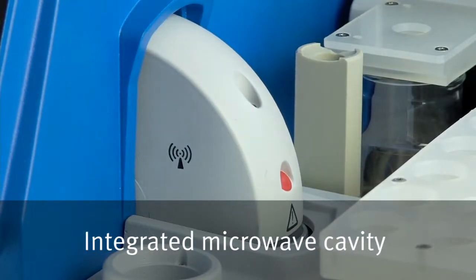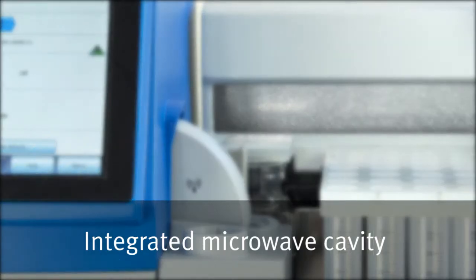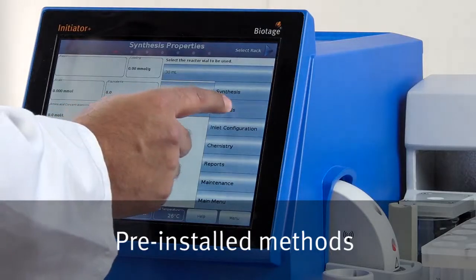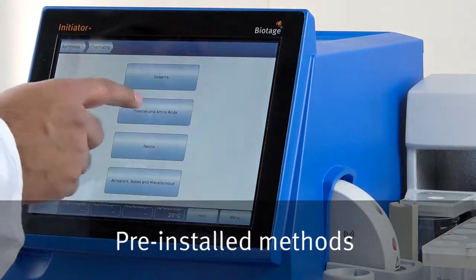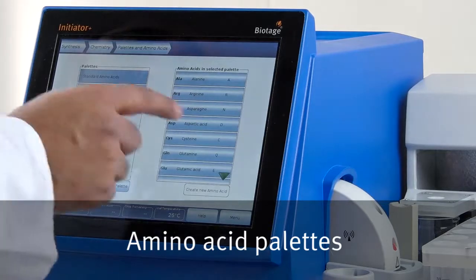The microwave unit is based on our best-selling Initiator Microwave platform. The system comes with a number of pre-installed methods and amino acid pallets, which can be easily customized.